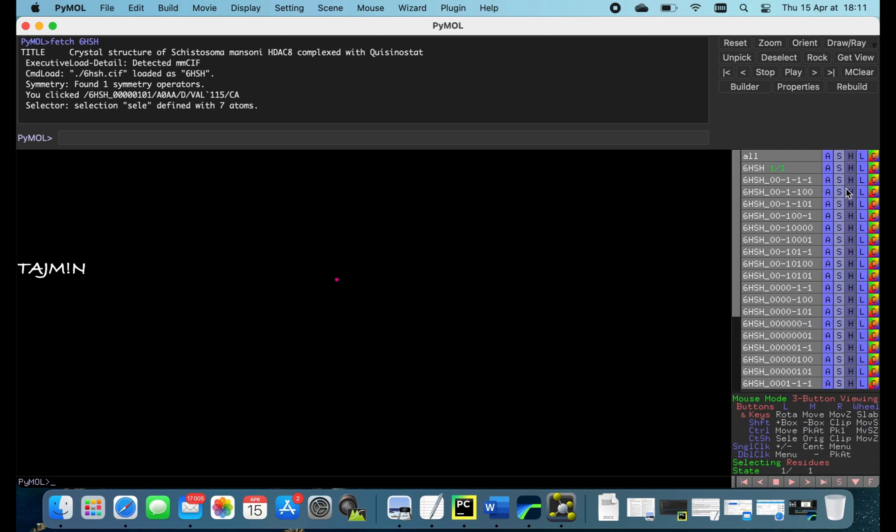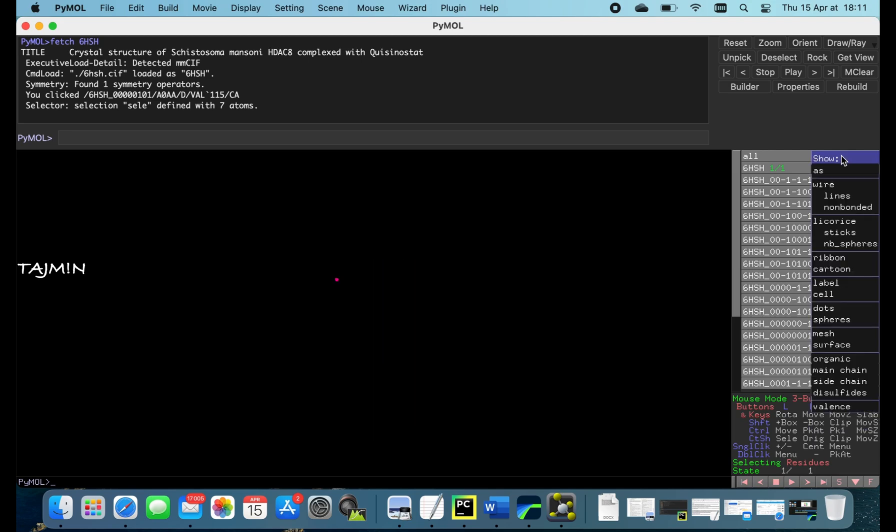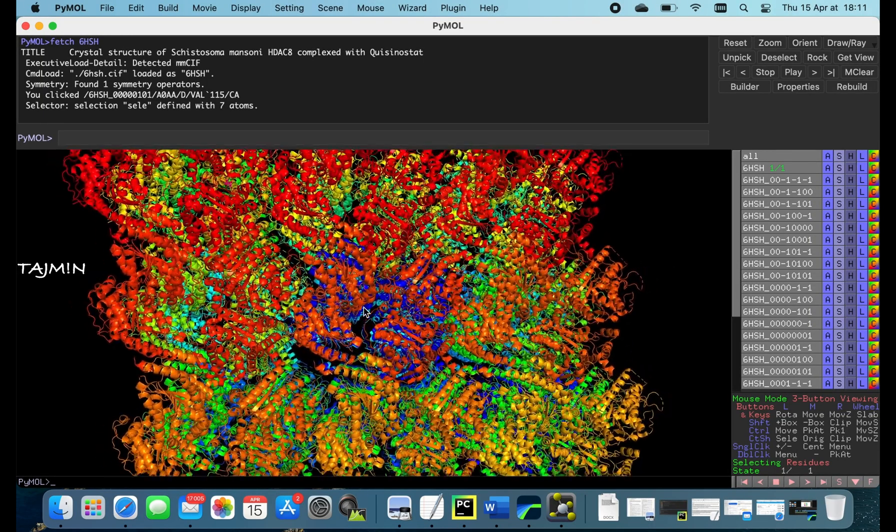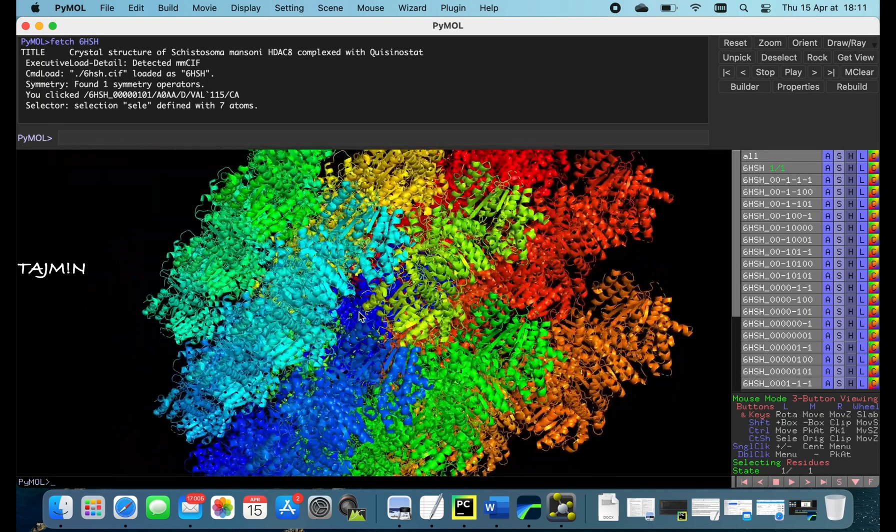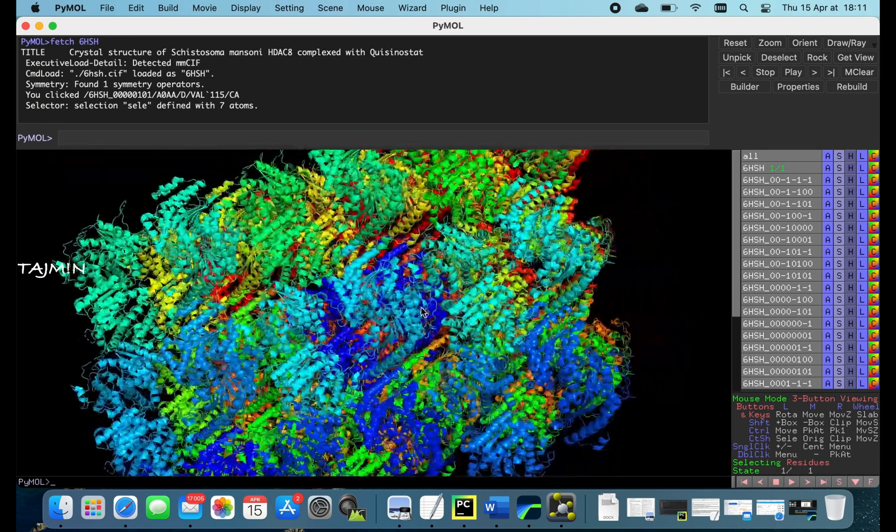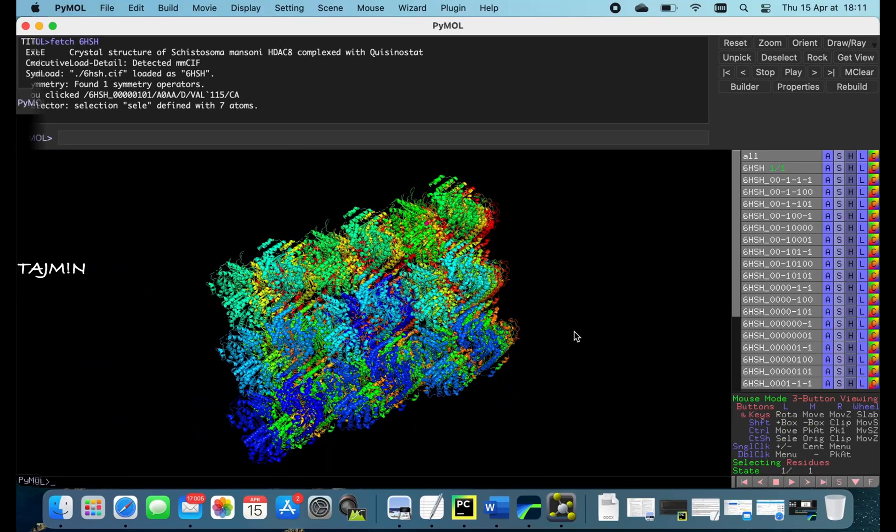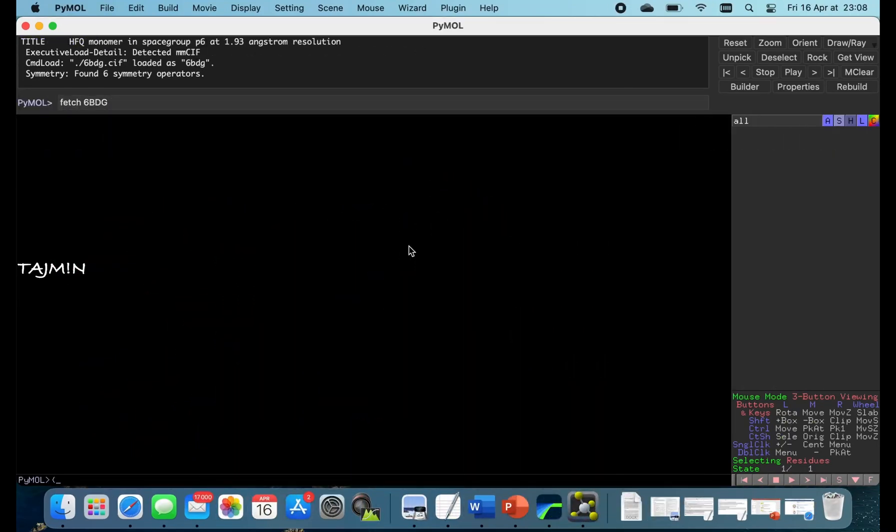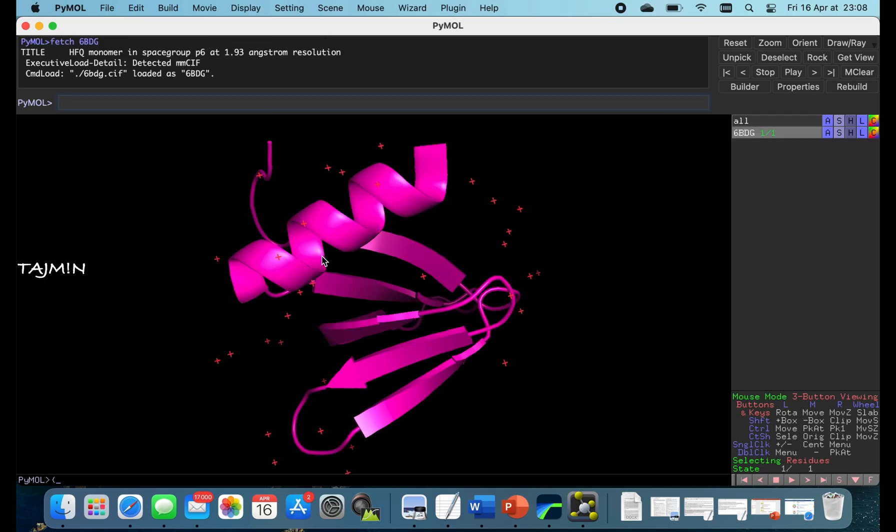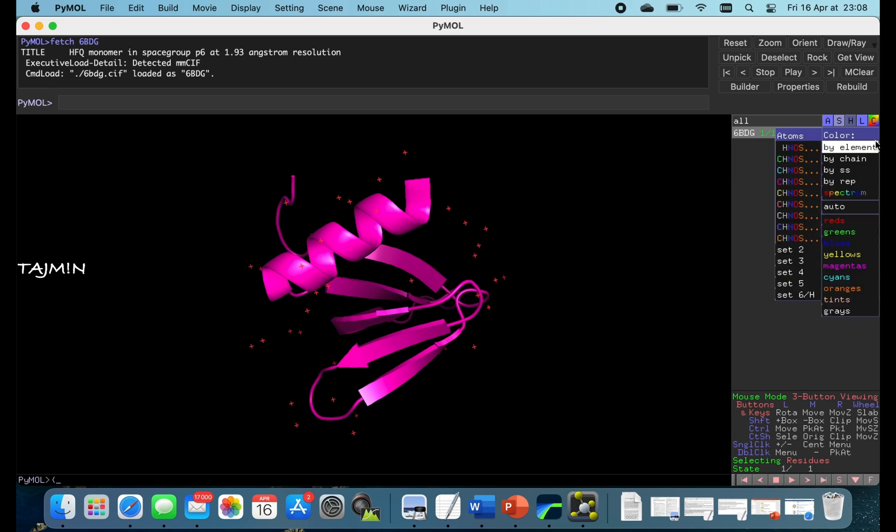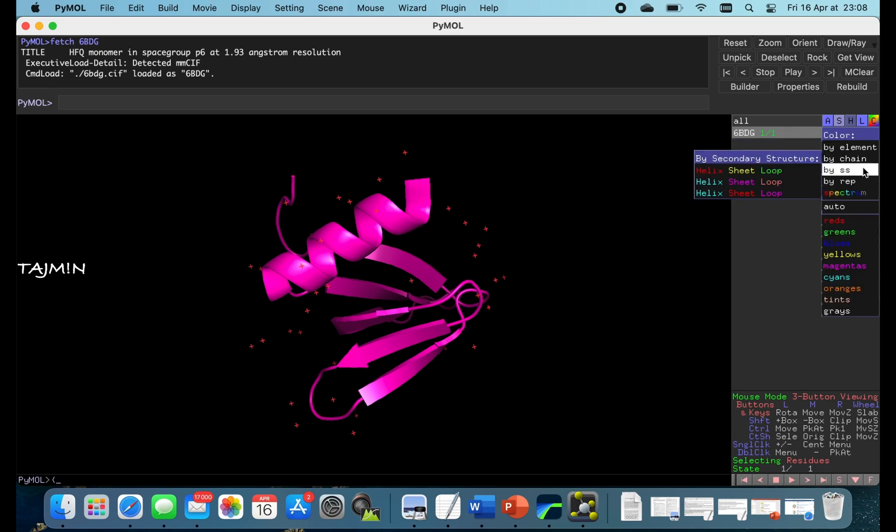The structure is in P1 space group. I will try to open another structure with a P6 symmetry so we can see the crystal symmetry in this way. The structure I'm opening is 6BDG. It's a structure of an RNA binding protein. Let's show the colors by secondary structure and generate symmetry mates.